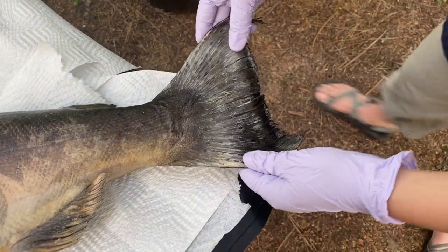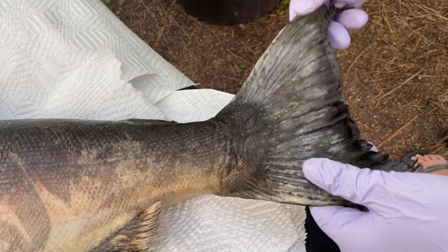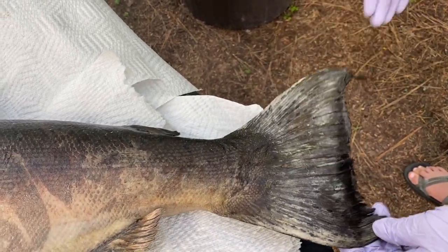And the last fin is the biggest, which is the caudal fin, which is the tail fin. And that is going to be where they get all of their momentum to swim forward.